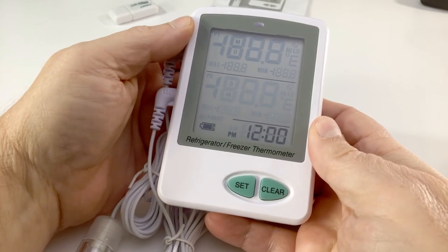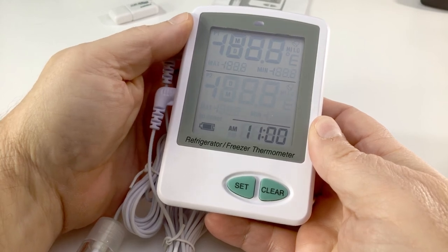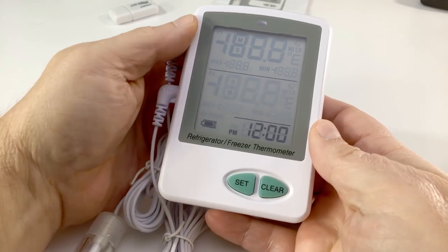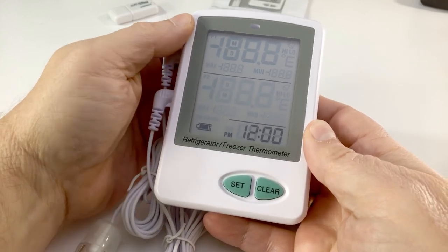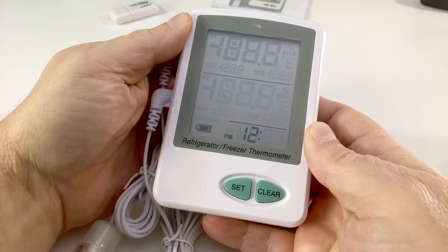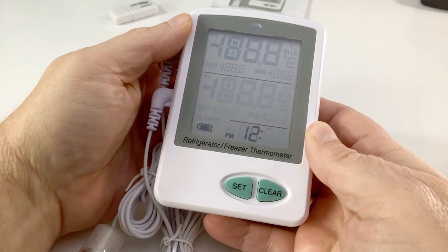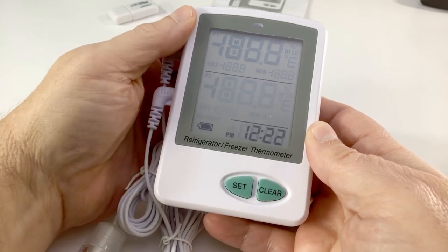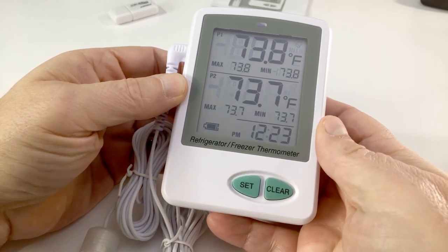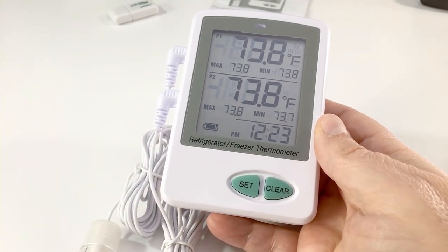For the hour format it is 12. To show you, going back takes you to 11am; in 12-hour format go forward to 12 and press Set to make your selection. It is 23 minutes after — press and hold the button to scroll quickly forward to 23, then press Set. The unit is now configured for date and time. We will now set the alarm set points.